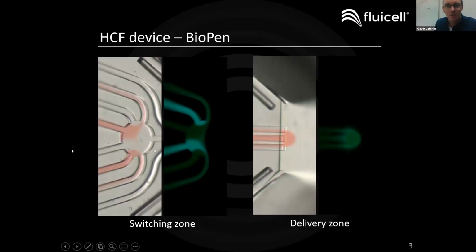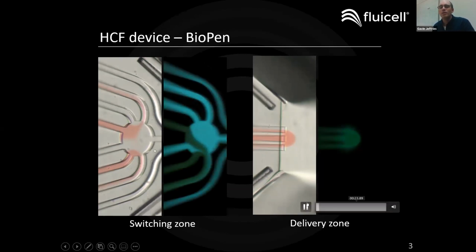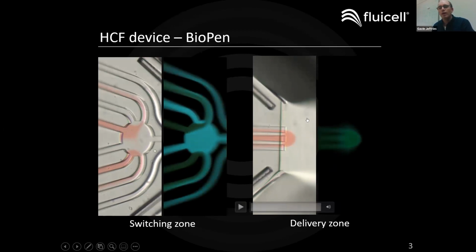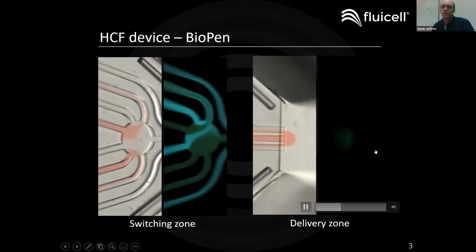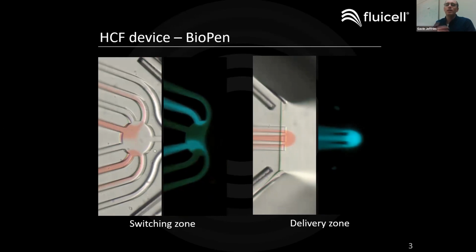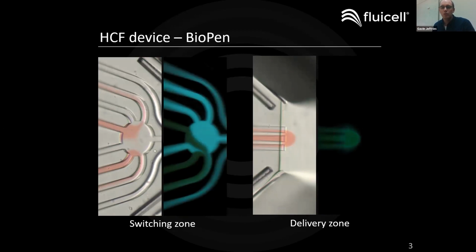So I actually just grabbed this slide from an old presentation just to give Professor Hoffman an updated set of images on things. So we can actually show how the hydrodynamically confined environment changes in real time. So we can see these very strongly fluorescent compounds actually changing. What we have here, especially in these two zones on the right side, is demonstrating one liquid being introduced into another one, and there's no mixing and there's no loss.